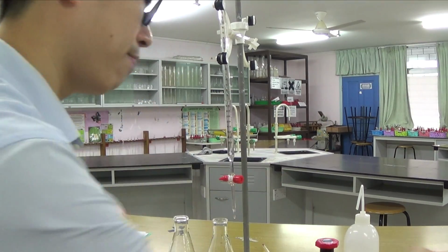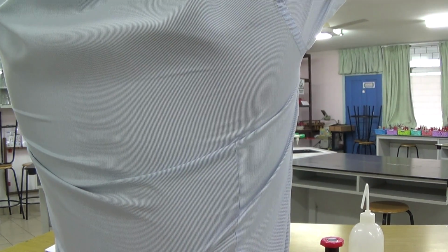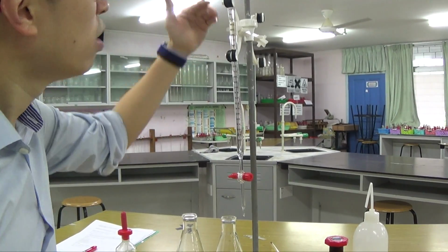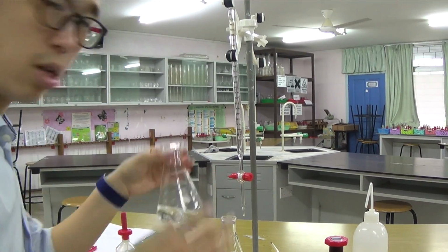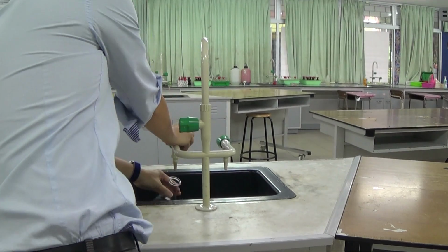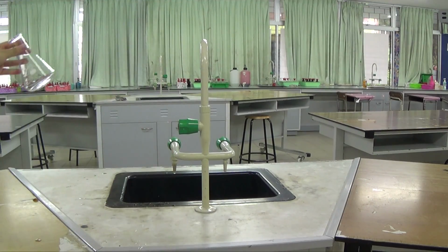Anyway, let's refill our burette a little bit with this thiosulfate colorless solution. I don't need a lot of it. I could fill it up to around 21, 22, give or take, since my exact titre just now was around 20, so I will have enough anyway, okay? So I'm just going to quickly wash my conical flask, because remember, we can just wash it with tap water first. So throw it down the sink. And then I'll quickly rinse it with distilled water.